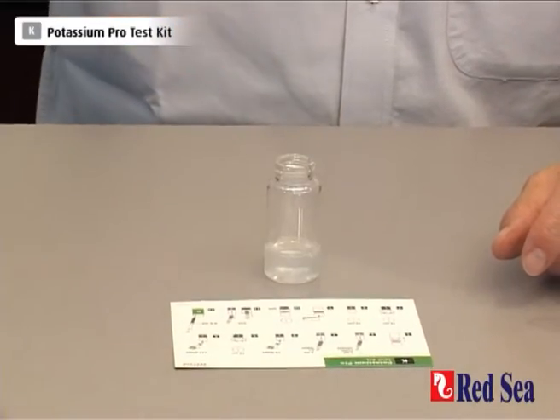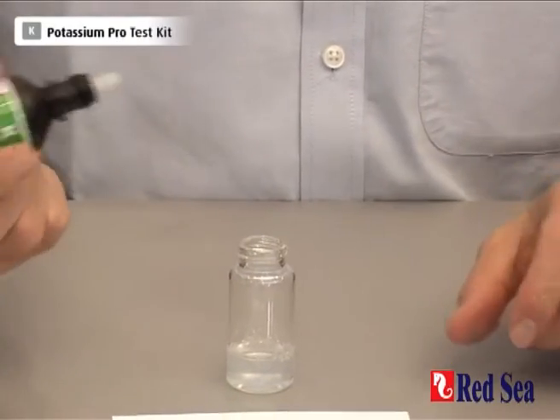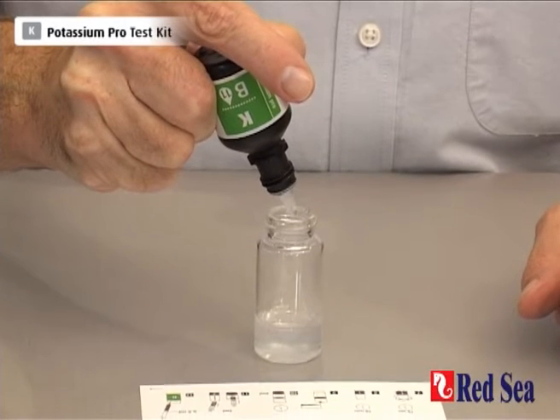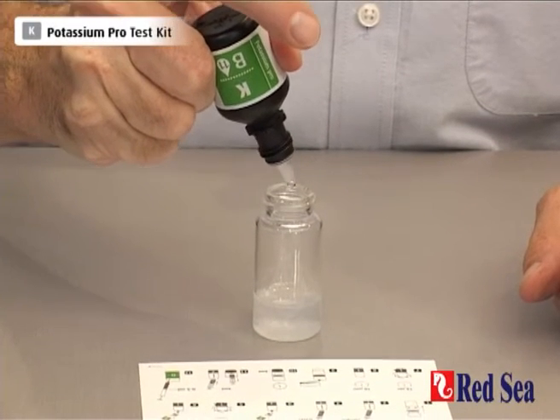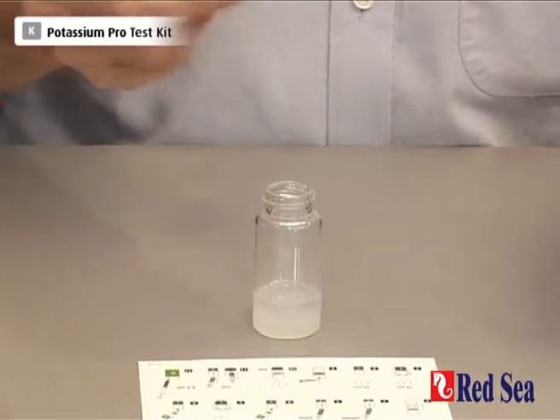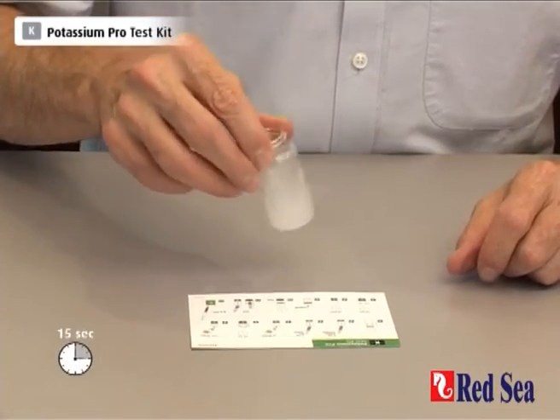We now add 11 drops of reagent B: 1, 2, 3, 4, 5, 6, 7, 8, 9, 10, 11. Again shaking for about 15 seconds.